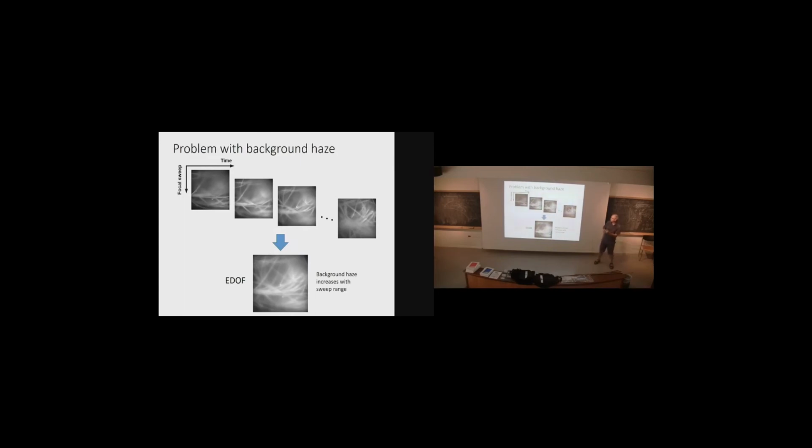Everything's equally in focus and out of focus, but the larger my volume, the more out of focus light I have, right? So my contrast goes down and down and down. And that becomes a problem with deconvolution because the noise from my background starts making deconvolution problematic. So is there a way to get larger and larger volumes and decrease the amount of background that I have in my system?